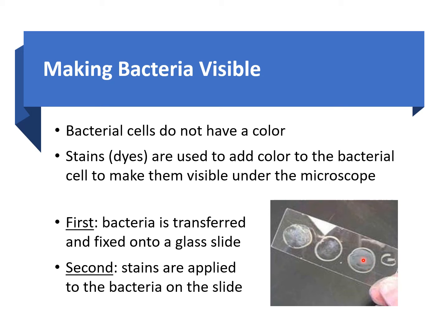So after you transfer your bacteria onto your slide, we're actually going to talk about how you prepare a smear. But you can see right here, here's a smear of bacteria right there. We're going to talk about how that smear needs to be thin. It needs to be a pretty thin smear, and it needs to be evened out. Like you don't want to have your smear over here really chunky and then over here thin.